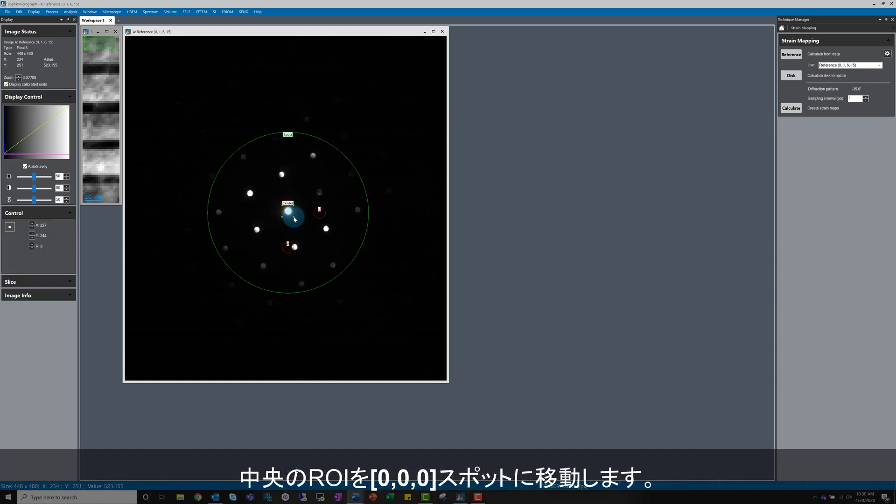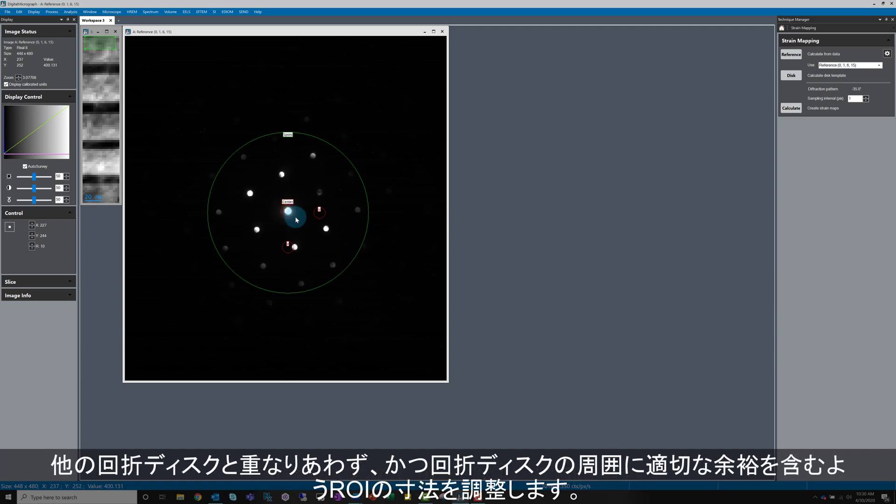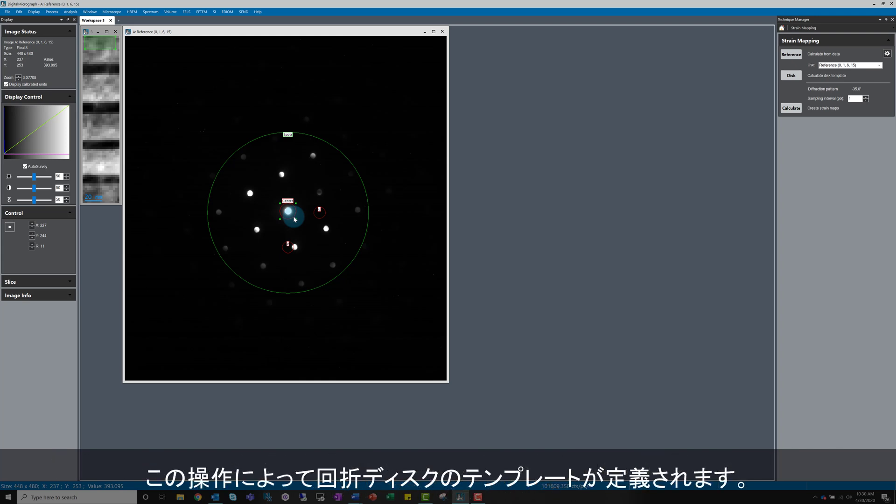Let's continue with the setup. Move the center ROI onto the 000 spot. Resize so it's large enough to include a margin around the visible disk, but avoid overlaps and close proximity to other diffraction disks. The size of this circle defines the area used for generating a diffraction disk template.